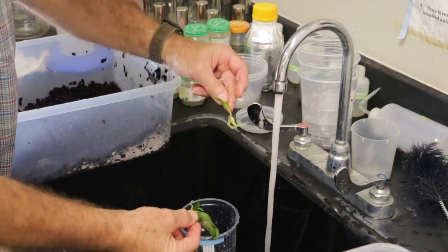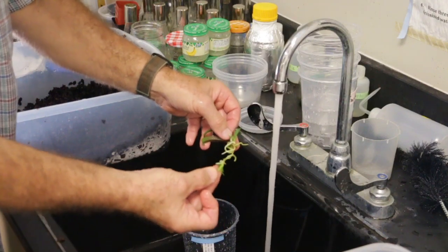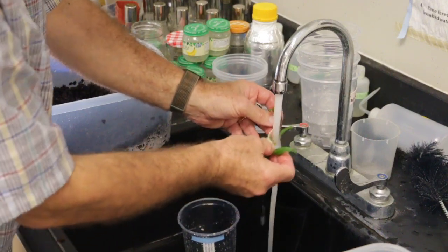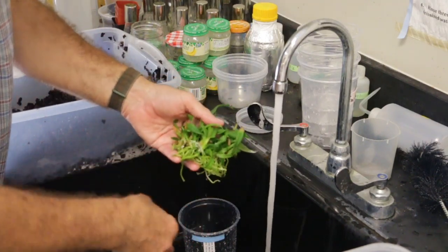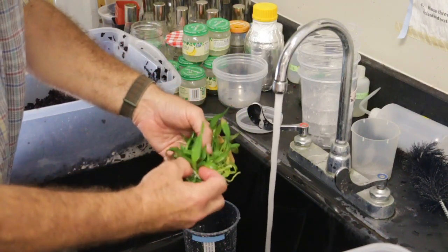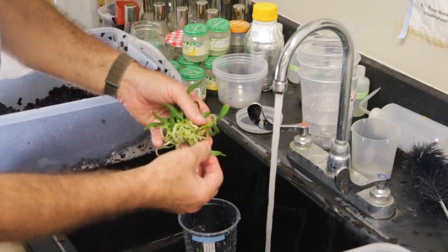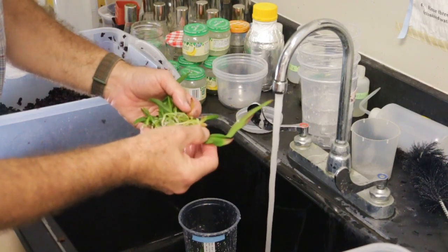That's tough. So here's one right here, small one, not great. And then here's another small group right here, and this one, I don't know if you can tell, found its way into the trash. But these will come apart. These plants are not really huge, but let's go back to this. The way to do this is to just tease these things apart; you don't really work the roots. You can tease them apart into smaller and smaller clusters. So there's the plant right there, and if you have the right conditions, they fall apart. This is a borderline save right here. It's a big one right here.